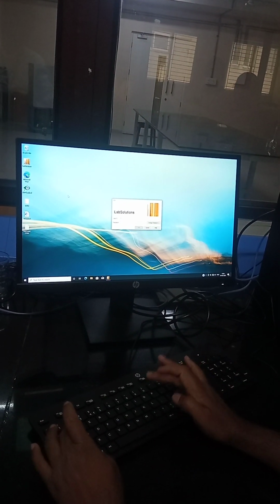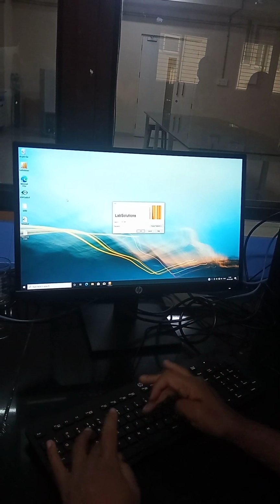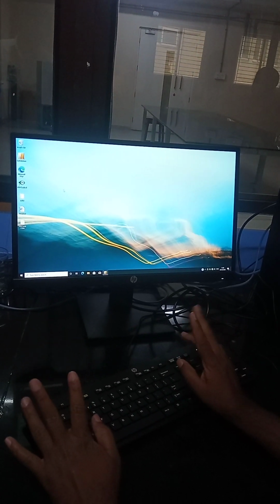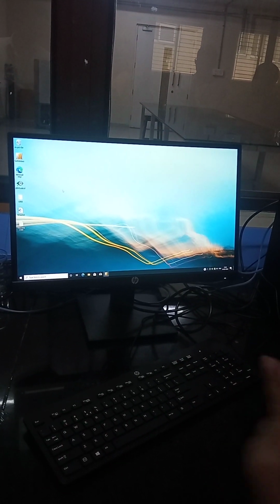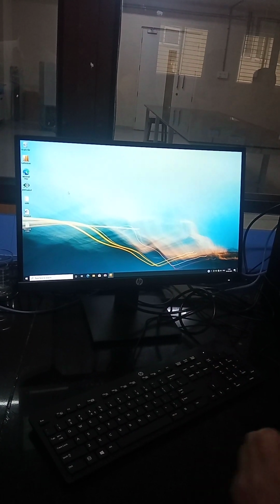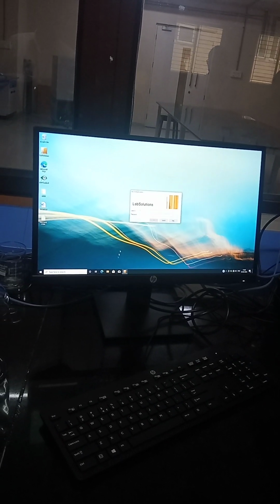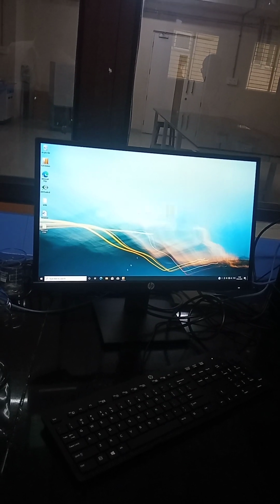Ours is OQ underscore user, and the password is Spinco. Our username is admin and the password is spinco@123. One backup as a sensor. Yes, that is very important. If in case you forget a password, a minimum of 2 passwords is required. In our case, after 6 months, unfortunately the software did not open. Keep an alternate secret password. That admin password should not be shared with anyone. Our login is username admin and password spinco@123.